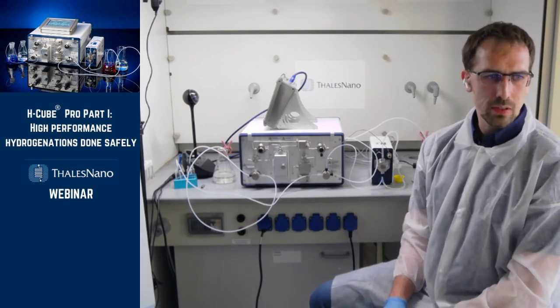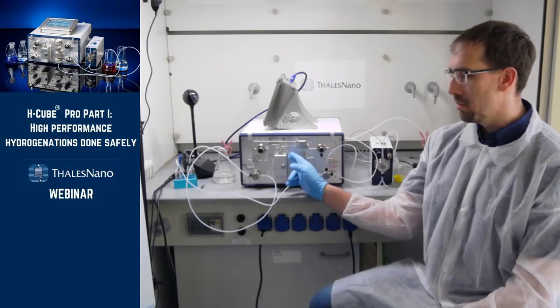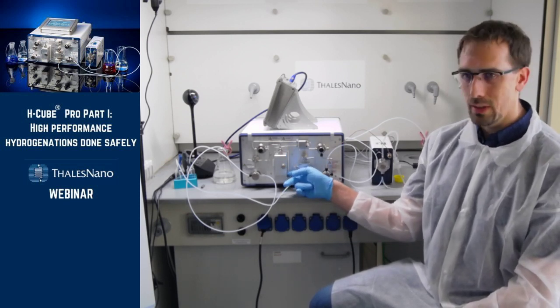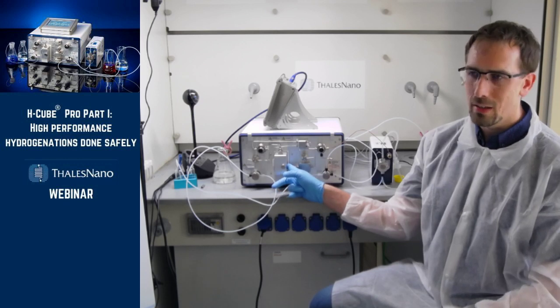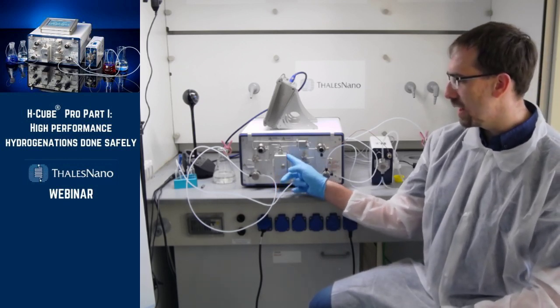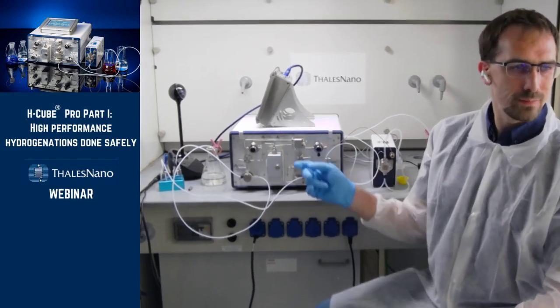How is the temperature controlled? There is a heater block inside this unit, and that's how we control it. We have three temperature measurements along this unit.